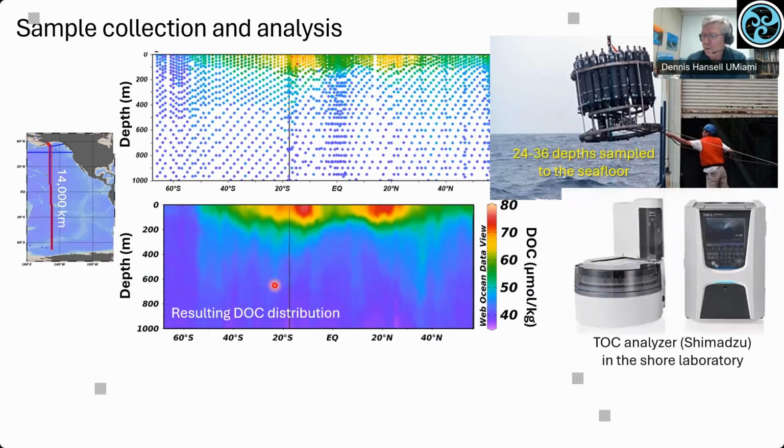And we are using this Shimadzu analyzer. It's a TOC analyzer. And when we started this business, we built these instruments ourselves. And we did hand injections with a syringe, and now it's automated. We can let it run overnight, which is a wonderful advance for us. We have 3 of those instruments in our lab because we process a lot of samples from these cruises. It takes on the order of 6 to 8 months to complete one of these. One of these 3 sections here, if we occupy it, it's going to be 6 to 8 months before we have our data out.